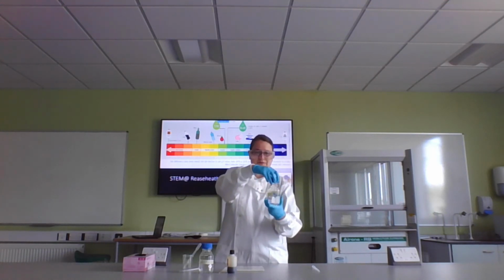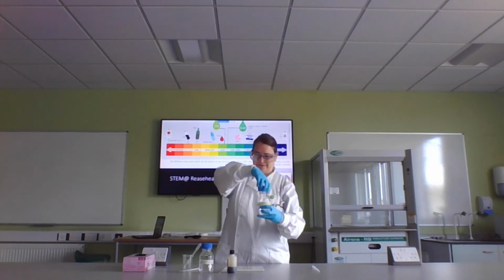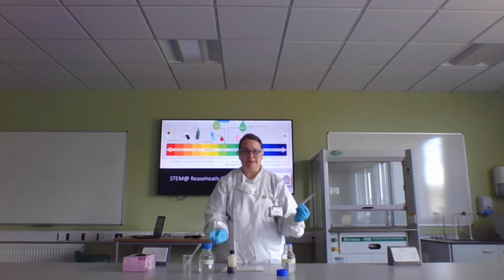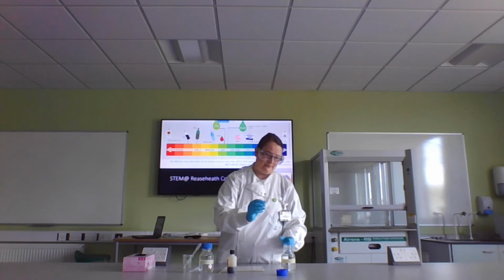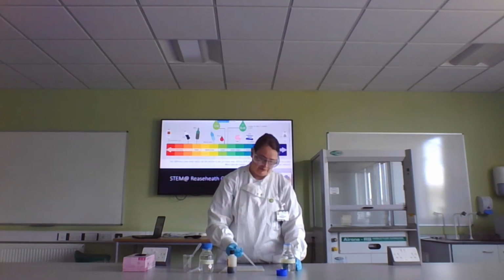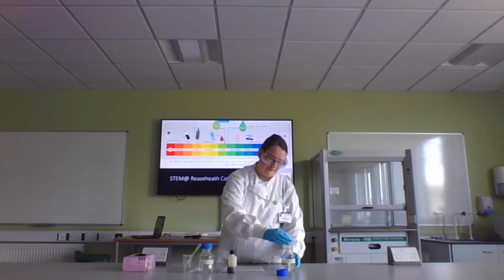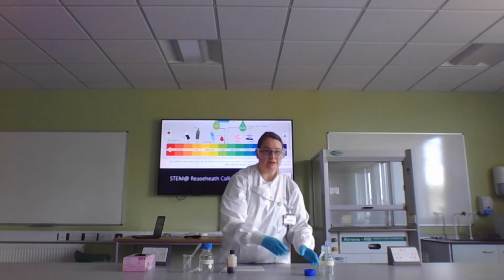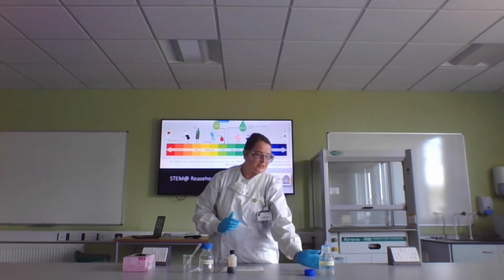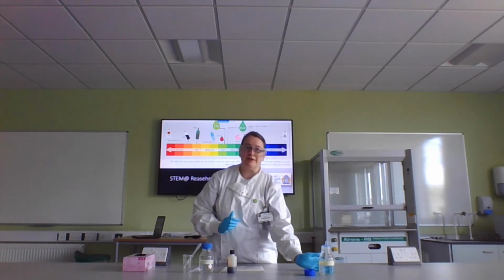So first of all, we've got the hydrochloric acid. You'll notice as I work here, I keep all my pipettes separate. So a drop of that on the tile. Another important lab technique, always keep your chemicals at least 30 centimetres away from the edge of the desk.